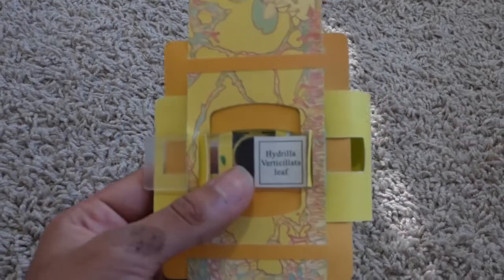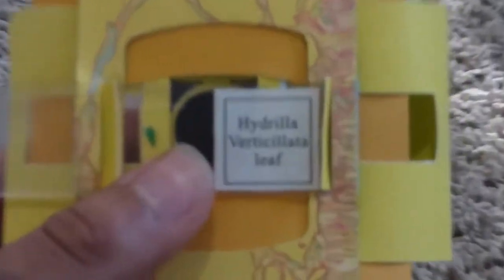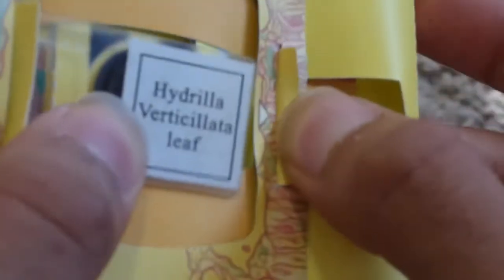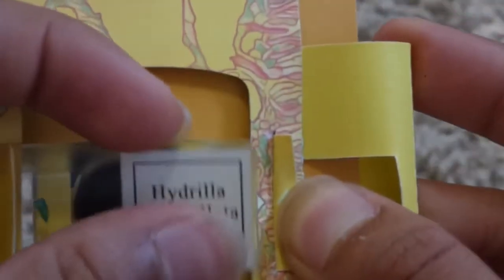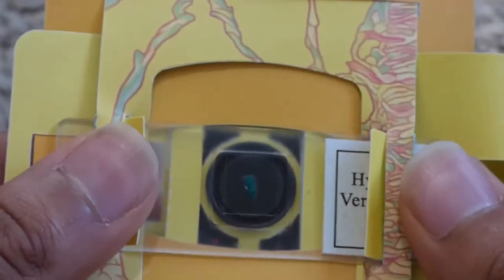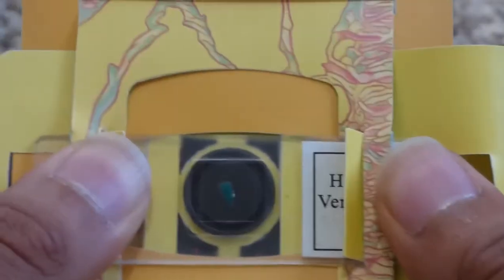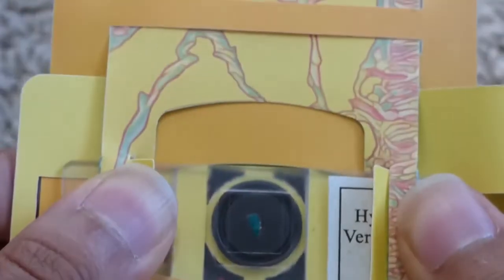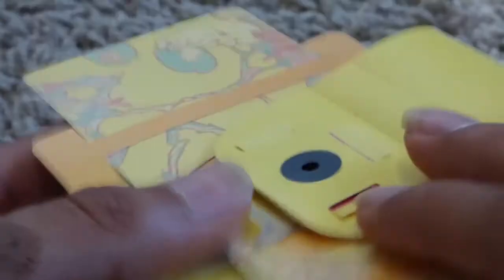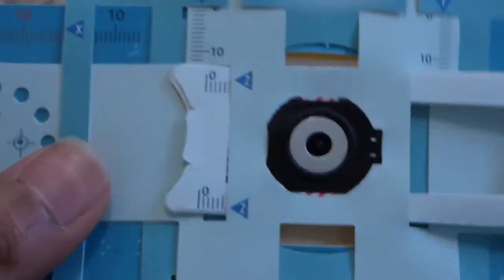Now we can do that with the other flap. Zooming in here to see it a little bit clearer, we can look at this flap right here, which simply just has to open to accept the edge of the slide. You can push that through and center it exactly above the magnetic coupler's center. This allows for a clear image and for us to be able to see our sample. I'm just going to take my back cover and close it up. The Foldscope is now ready for use.